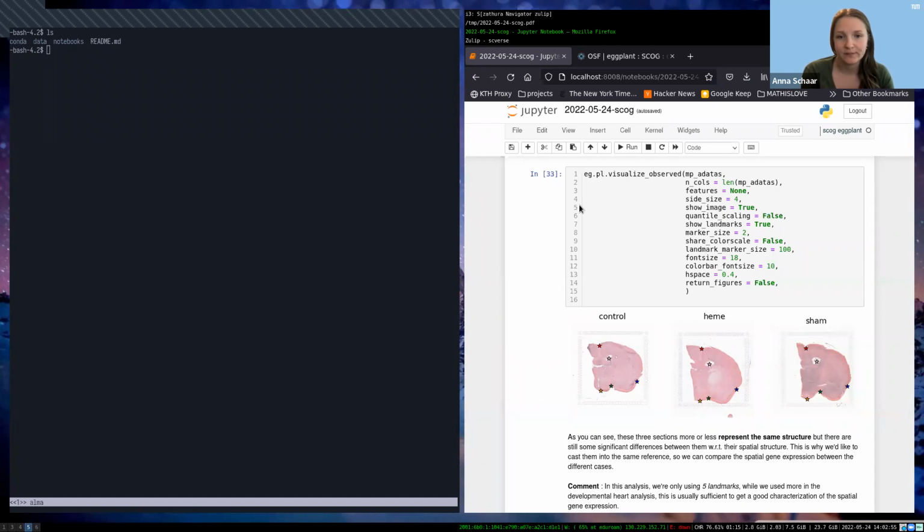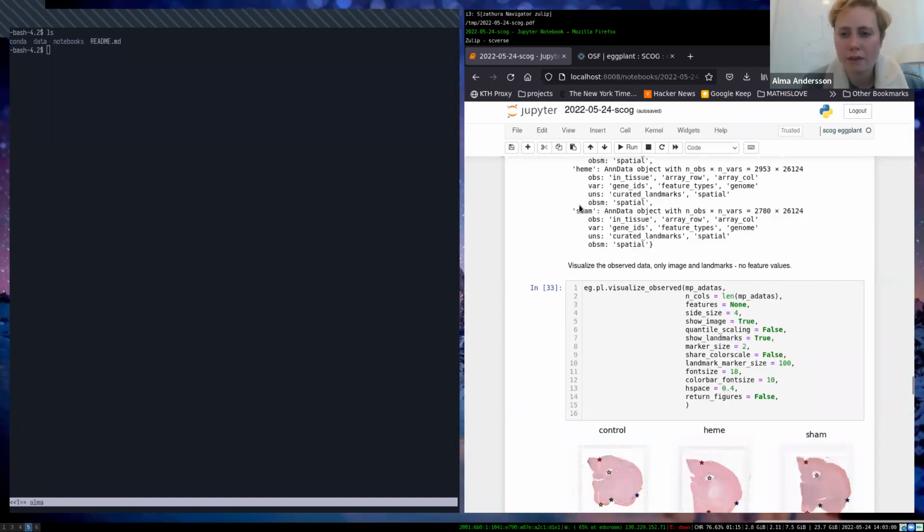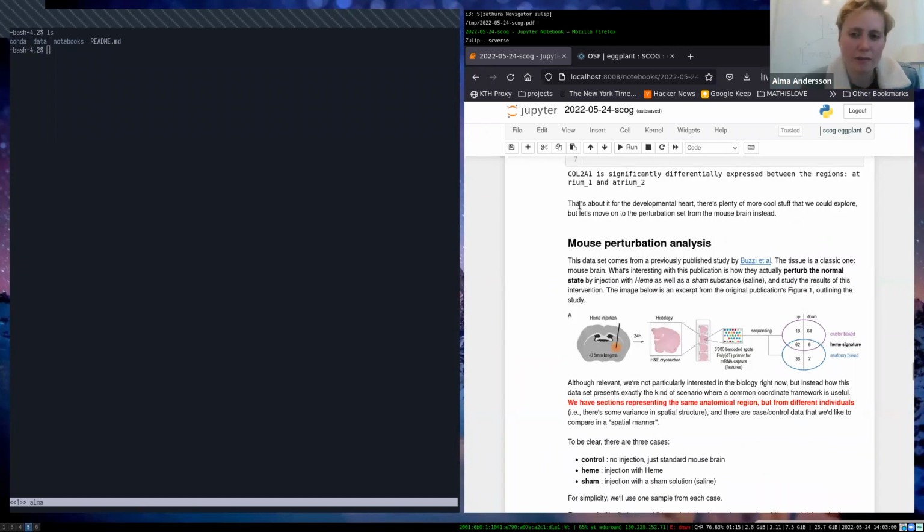The next question would be how would you determine the number of annotated regions in the reference? Right. If I'm interpreting that correctly, it's how many regions you should have, or how you define these different regions in the reference?